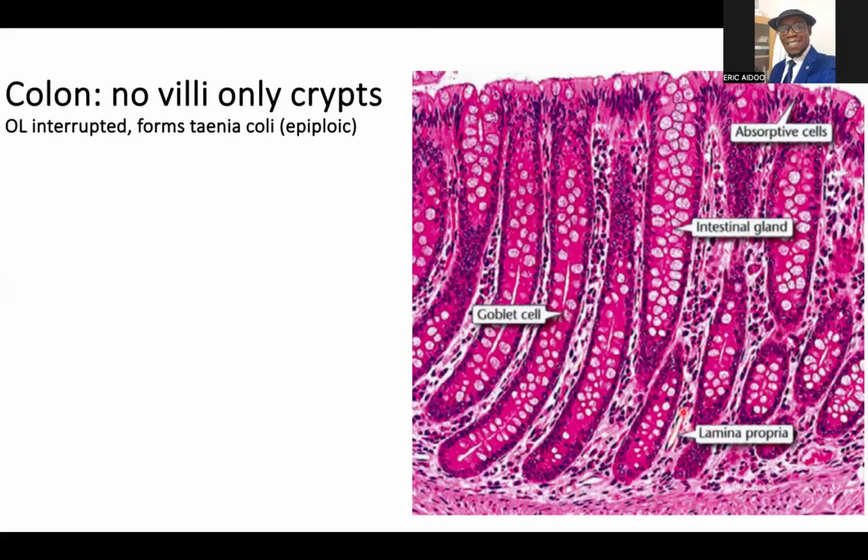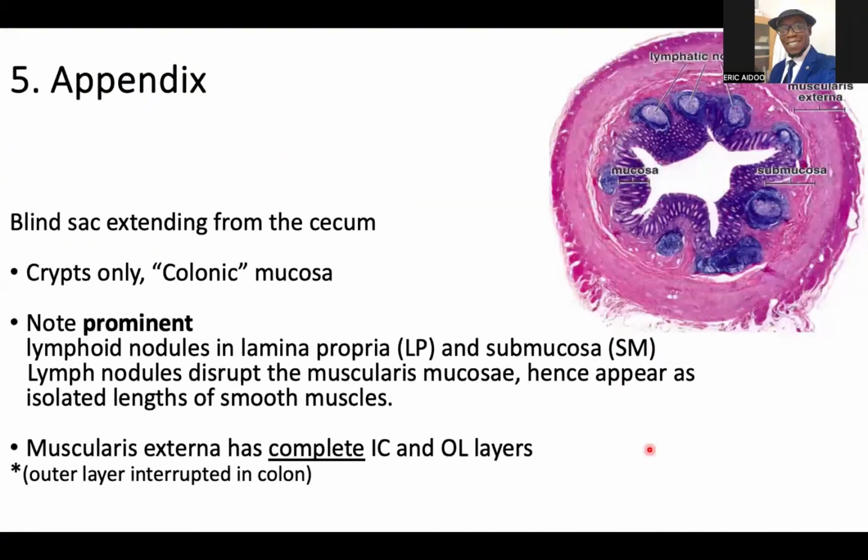So that would be the lamina propria. You can see right from here that there's a small lumen there. That tells you that this is the epithelial lining, all the way. So it's from the top and then it goes down and then curves and goes up again. Because this is so folded upon itself, you are not seeing much of the pits and their deep parts. The lumen, you can't see that. And that is how the arrangement goes.